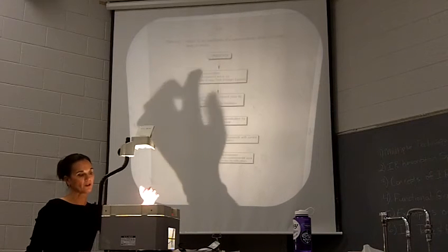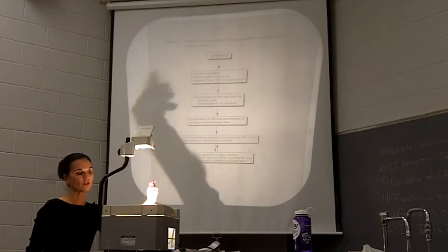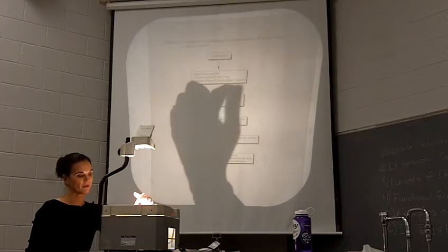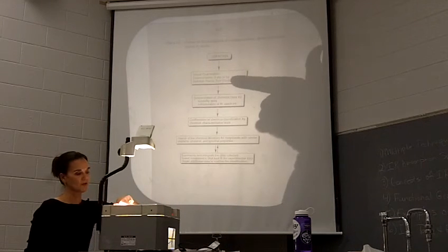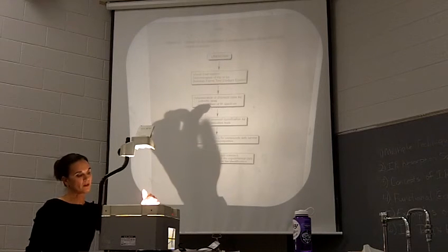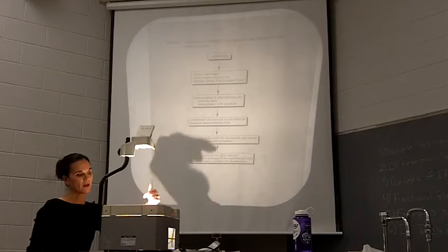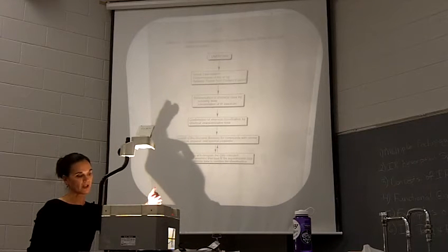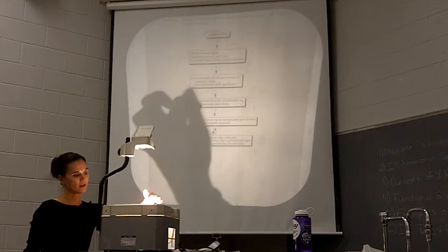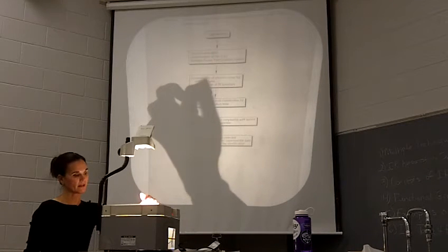You have your unknown. You're going to visually look at your unknown. What does it look like? Determine the melting point or the boiling point and the flame test. Don't worry about sodium fusion. We're just doing the flame test. You're going to determine the chemical class by solubility test, interpretation of the IR spectrum, and then go on to reinforce what you find here with the chemical tests.